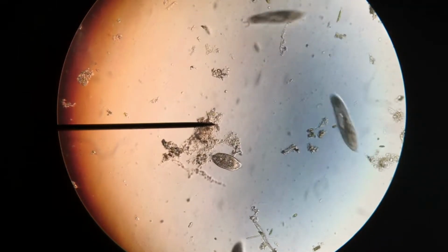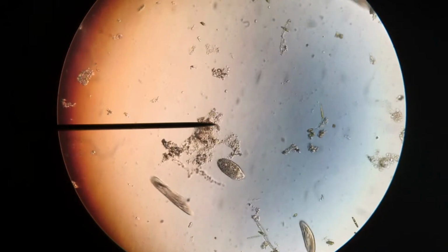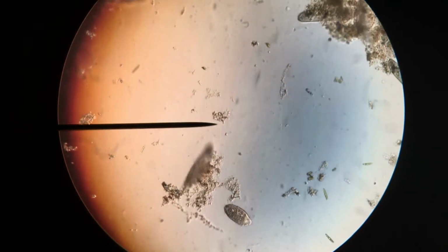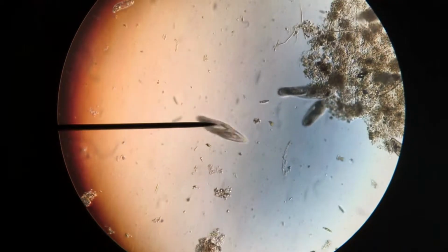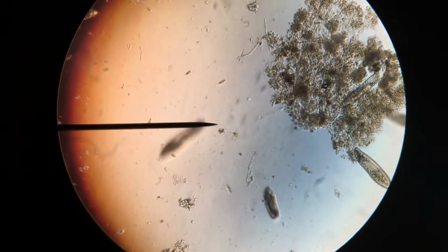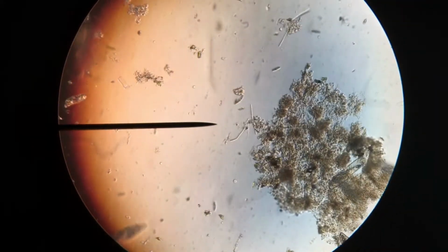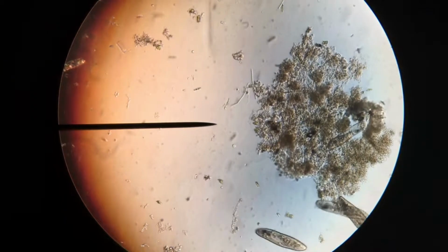There's another stylonichia. Right there is a euglena. I almost had him on the tip of my pointer.